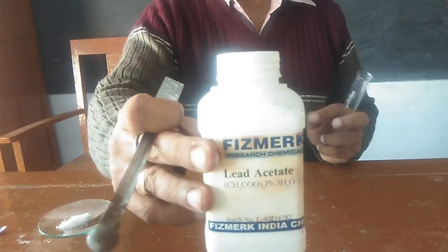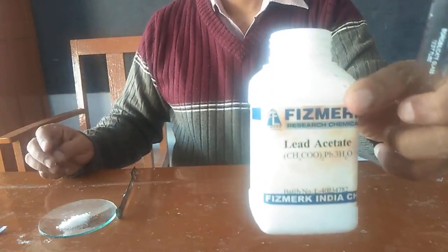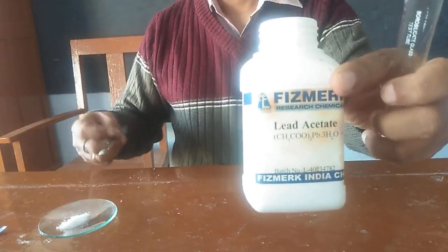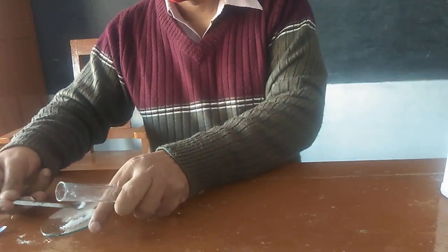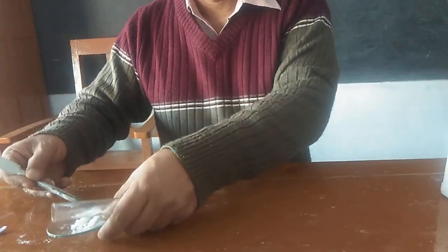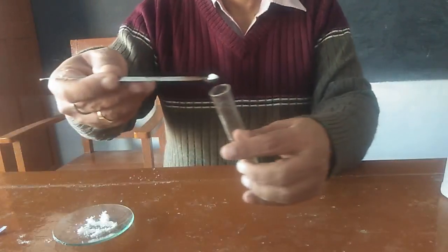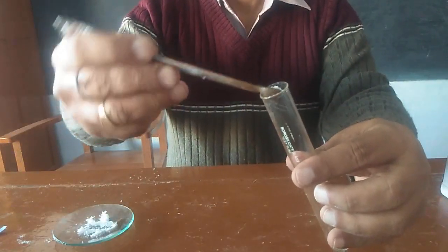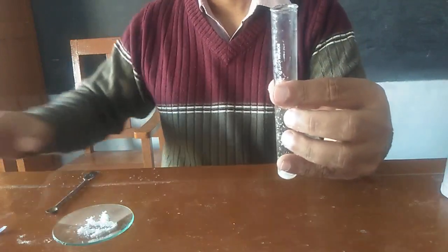Now, the test for acetate ions. Acetate ion belongs to group 1 of acidic radical, and it can be tested with the reagent of group 1, which is dilute H2SO4. It can also be tested with the help of dilute HCl.